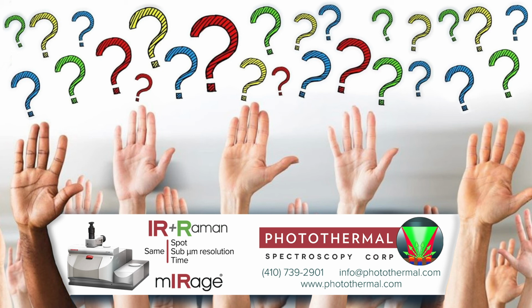This is a possibility. However, it is known that amyloid protein binds iron, and it is most likely that those iron clusters are co-localized with amyloid beta sheet structures.